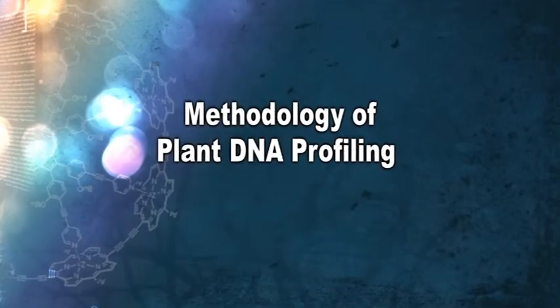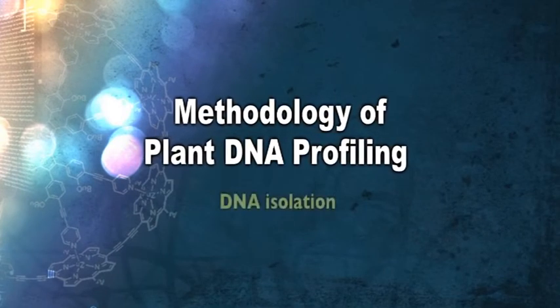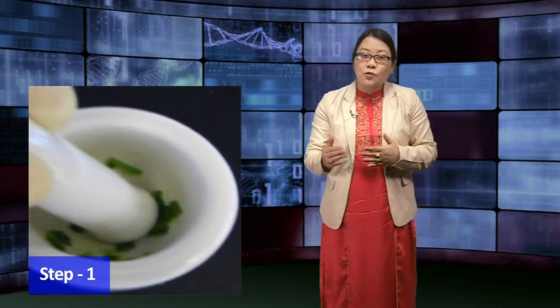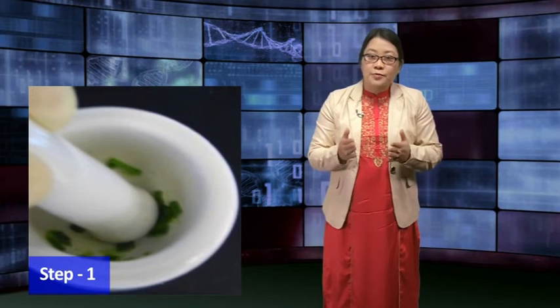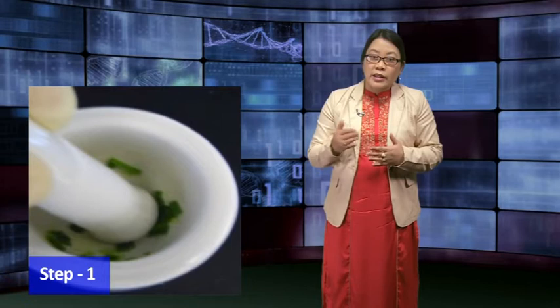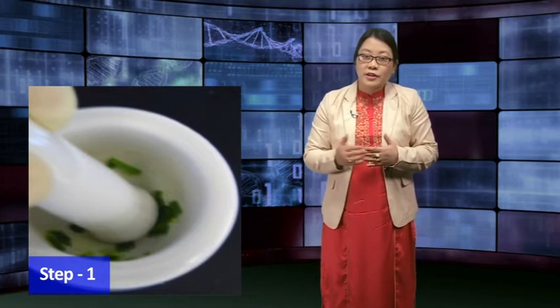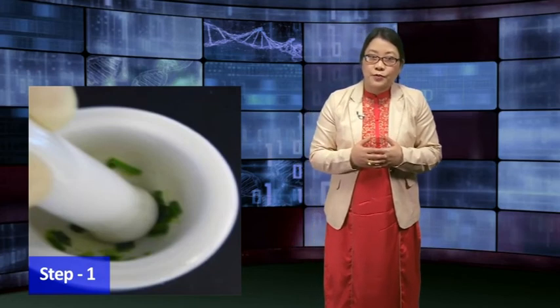Let us now see the methodology of plant DNA profiling. We will start with DNA isolation. For this, 100 mg of plant tissue is ground in 1 ml of pre-warmed CTAB extraction buffer containing 1% PVP and 2% beta-mercaptoethanol and incubated at 65 degrees Celsius for 1 hour with occasional mixing.